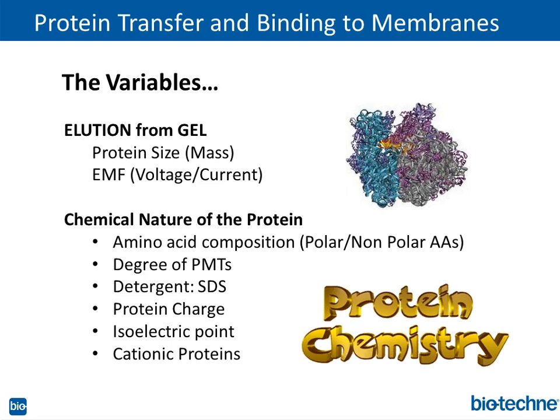So what was the answer? You don't have to use Towbin's buffer. There are other transfer buffers. I recommended what's called a CAPS buffer, which has a pH of 11. You shift the pH up, you give the protein a net negative charge, and the protein moved. Again, not common, but just so you know, you can search the literature and find different transfer buffers.